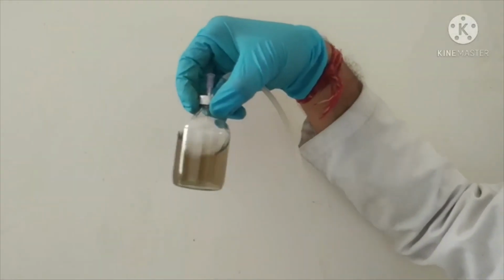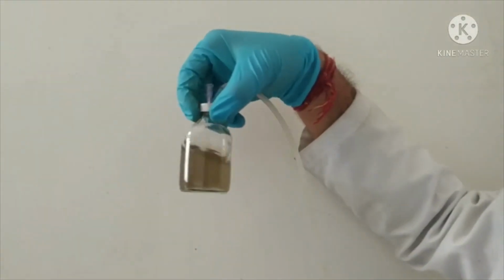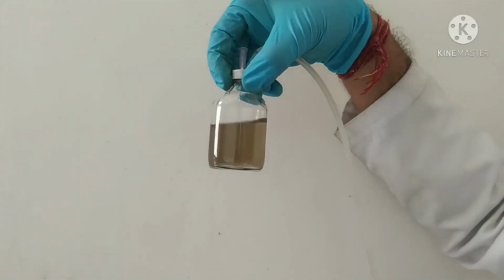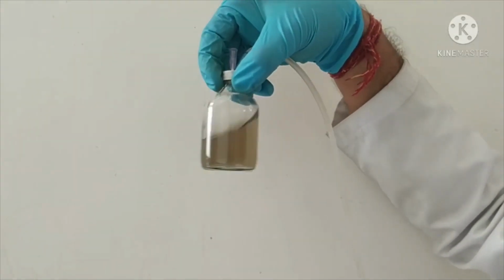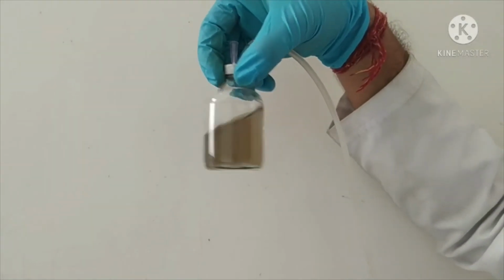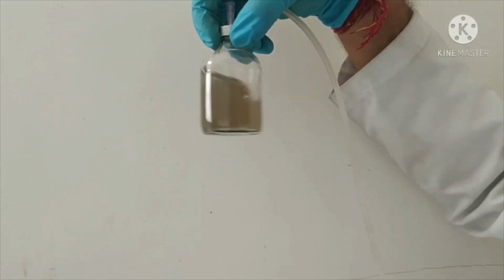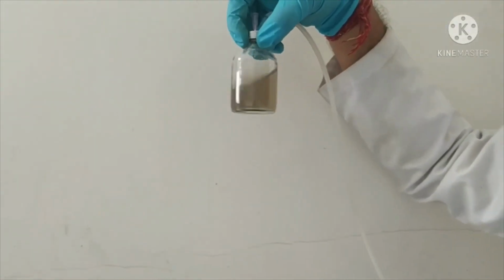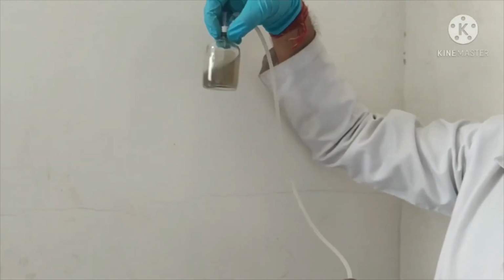This is how we can measure whether the condition is anaerobic or not. You can provide an indicator like resazurin, and that will help you maintain the anaerobic condition all the time. If oxygen comes in, it will show a color change. This anaerobic medium will be used for adding the inoculum and generating biogas under anaerobic conditions.